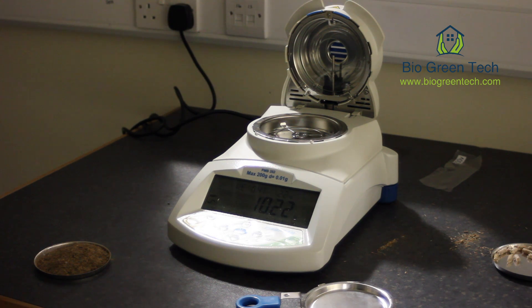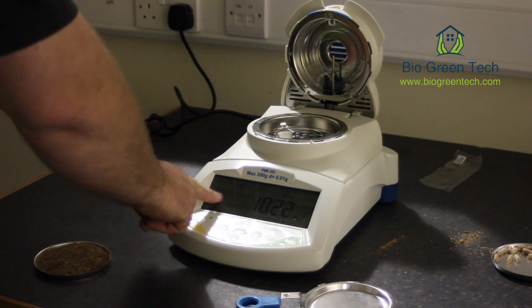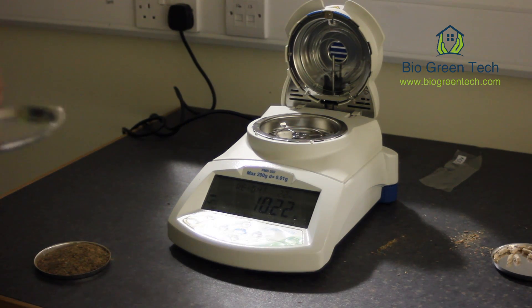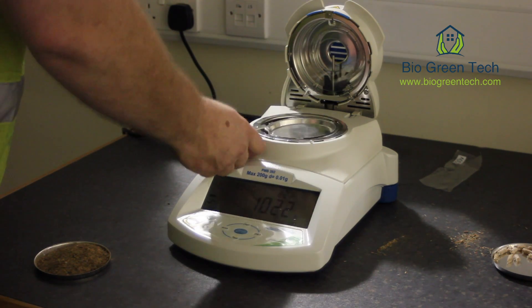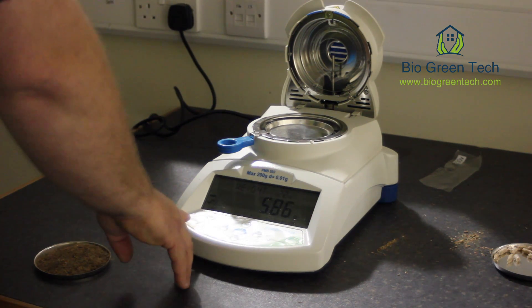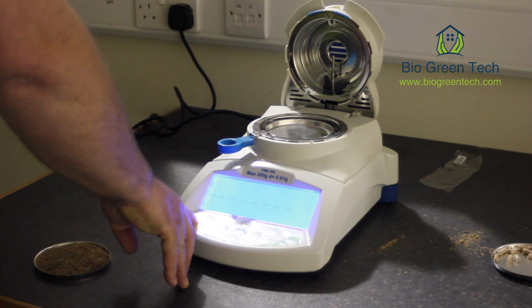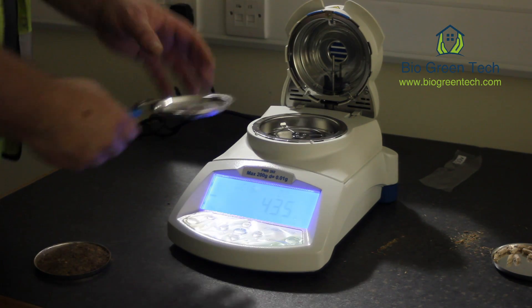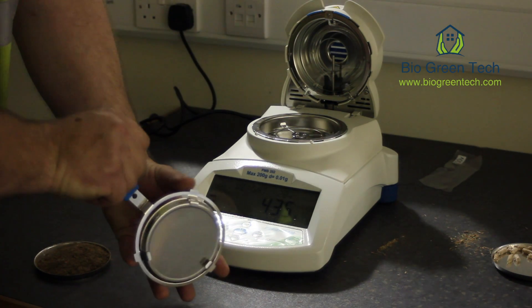What I'm going to show you today is a demonstration of the PMB202 Moisture Meter machine. What we use these for is to measure the moisture of the material before we put it into a briquette or pellet. What we do with the machine is zero it, because what it's doing is actually weighing the material.